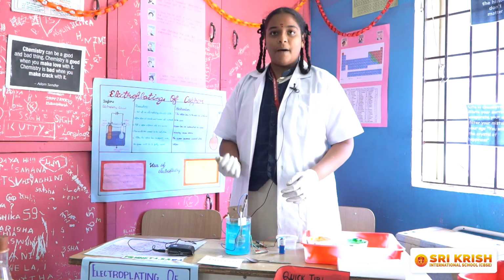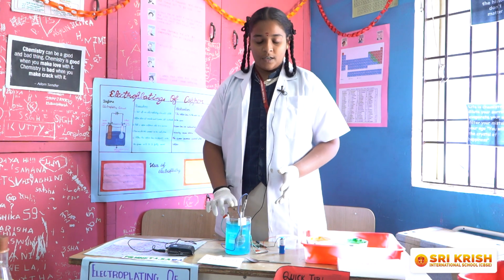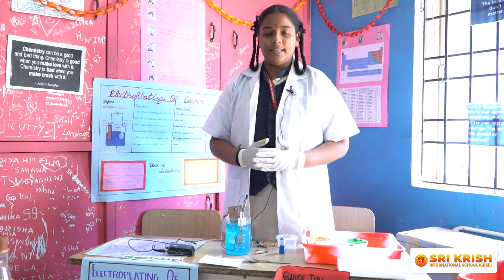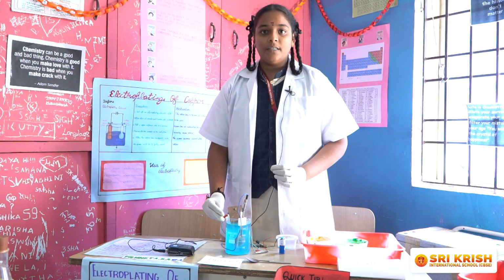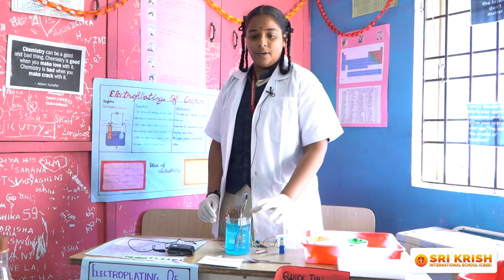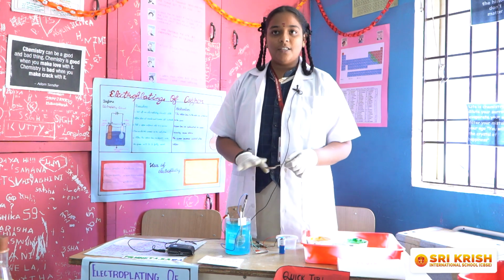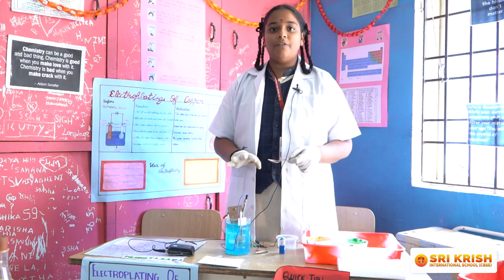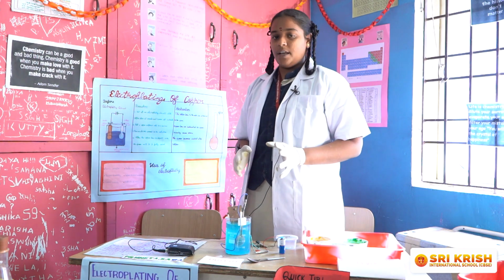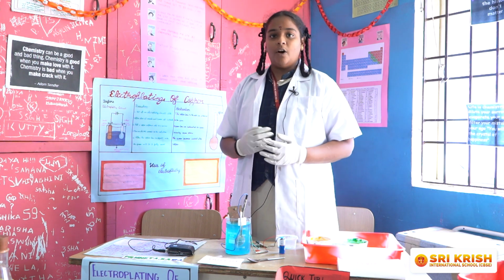When electricity is passed through them, the copper ions in the copper sulfate solution and the copper plate will move towards the spoon and deposit on the steel spoon, where the copper is oxidized at the copper plate and reduced at the spoon, and this deposition on the spoon helps in coating of copper on the spoon. The major applications of electroplating are making ornaments and the automobile industry.